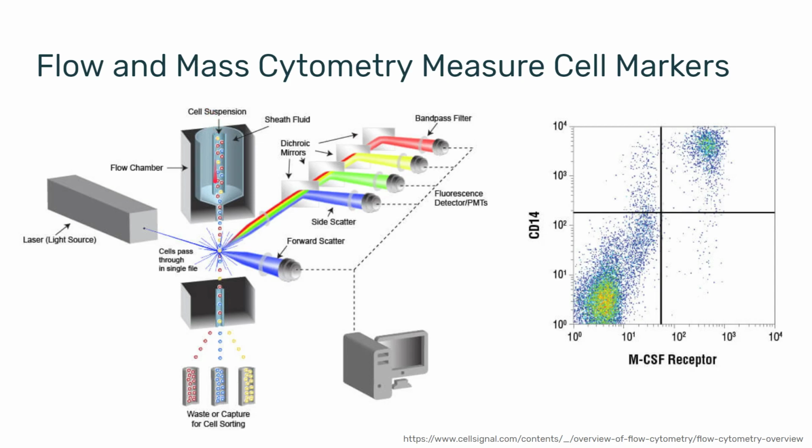We run these cells through a tube, shine a laser on them, and measure the light that they reflect. In this example, different lights will be proxies for different markers. And again, the bridge between the fluorescence and the marker are antibody molecules that bind to the target markers.